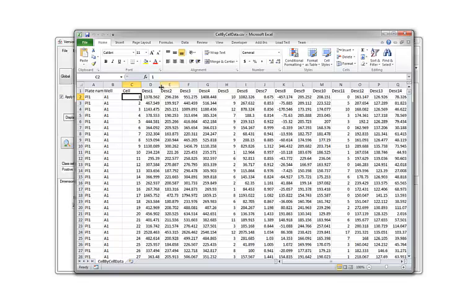So it means that the data generated after such a screening are quite huge. That's why for the HCS Data Analyzer we decided to move all the data into a database. Let's take a look now at how to import the data into HCS Analyzer and how to create this database.